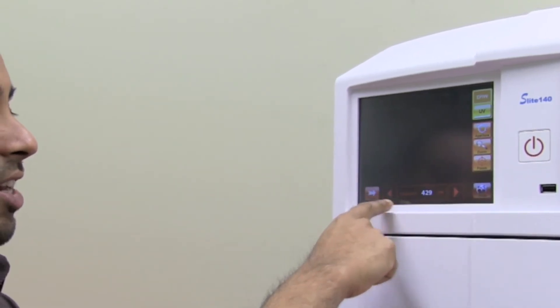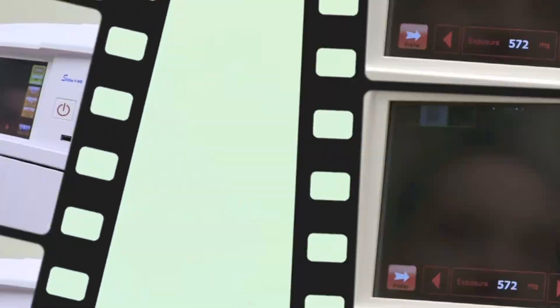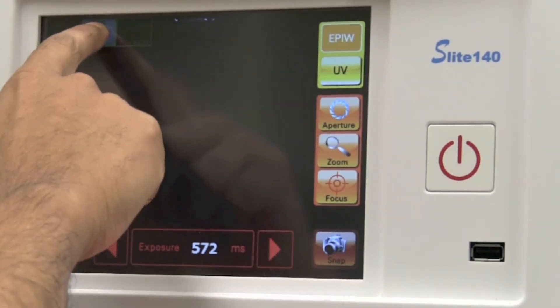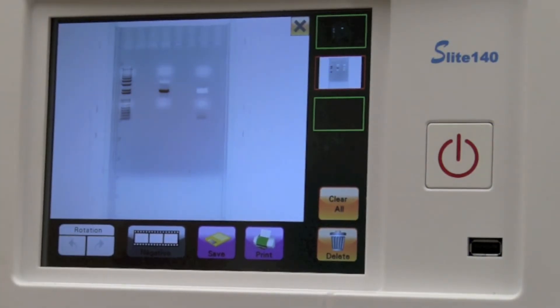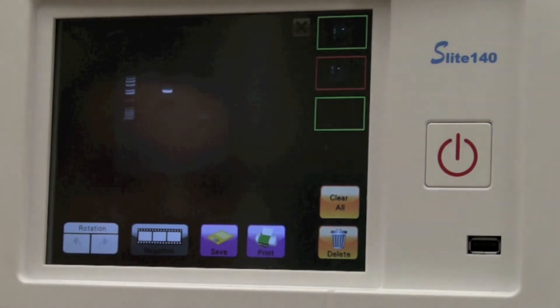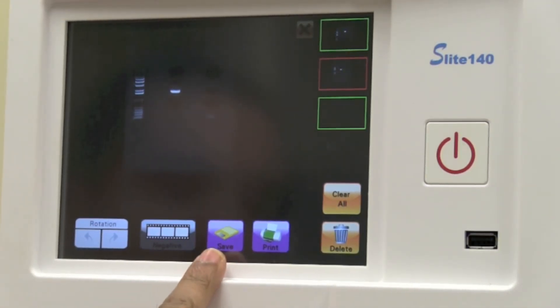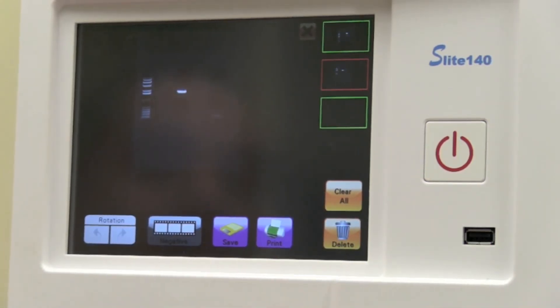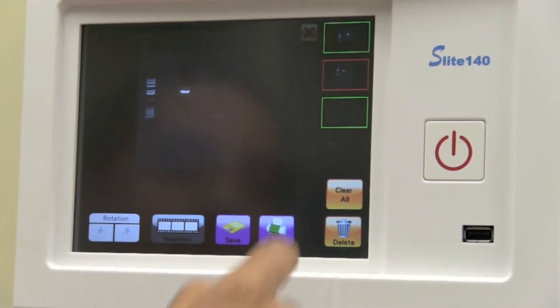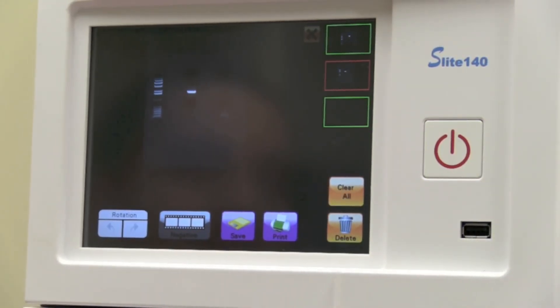You can see I'm changing exposure here really quite easily. You can also take a snapshot quickly by pressing this button right here. Looking at the image gallery, we can see images taken earlier. This image has had a negative applied to it — we can remove it just like that. We can also rotate the image, save it to a USB or over the network. There's also the ability to print, clear all images, or delete the file.